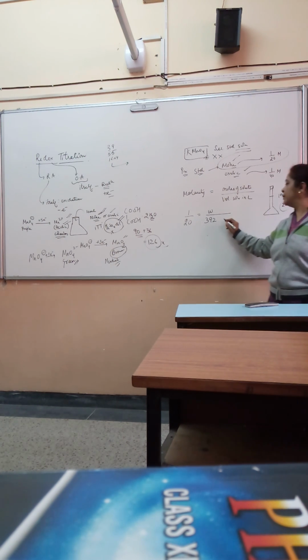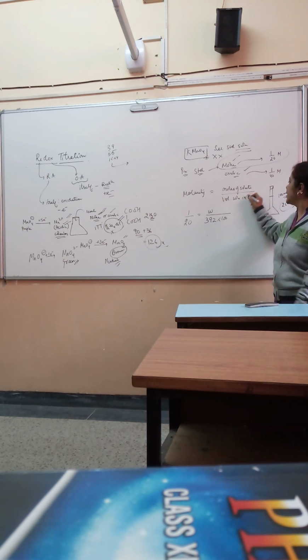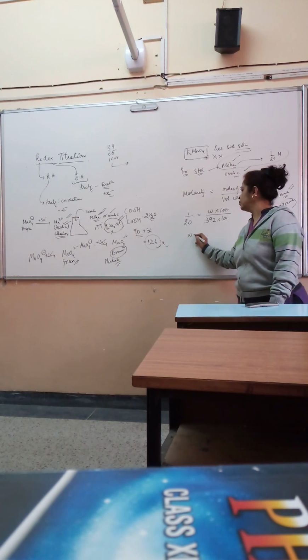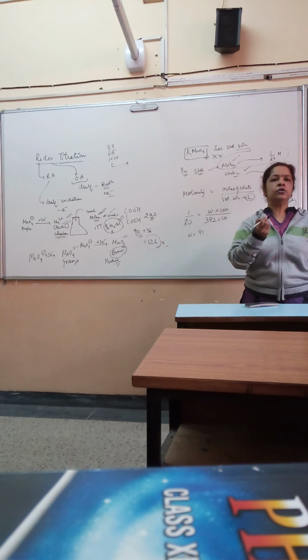We use 100 ml, so your volume is 100. What's missing? 1000. Because you require it in liters. तो ऊपर ये 1000 लीटर जाए. Only then you do the calculation. Your aim is to find out W, which can be done. You weigh it and then use it for preparing the solution.